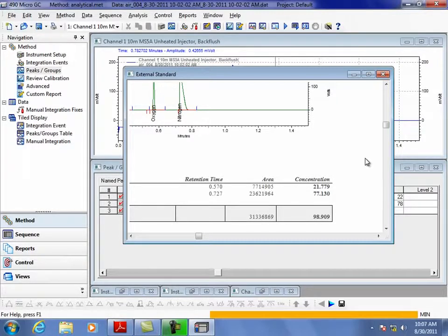Yeah, lower pressure. Doing partial pressures is really hard to get any kind of reproducibility on too, because the vacuum pump works the same, but if it's at 0.95 bar or atmosphere, and then it's 0.9 atmosphere, there's a different amount that it's pulling into the system. So your reproducibility may not be real good. You might like to try to get a little bit of positive pressure somehow. That might be another reason for a syringe injection, or for having the gas fill into a bag, like a Tedlar bag, and then maintain a little bit of pressure on it.